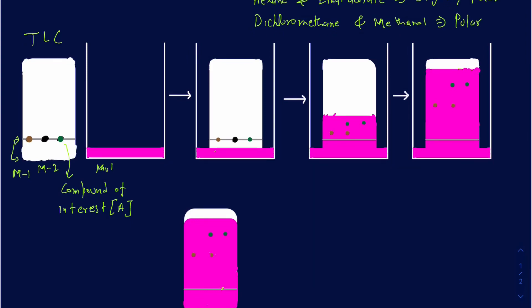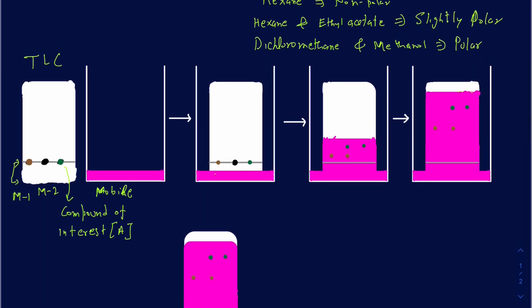You put this TLC plate into a beaker that contains the mobile phase. One thing you must make sure is that the baseline — where your starting point is for the compounds and mixtures — is a little bit above the surface of the solvent. If the mixture is inside the solvent, it may dissolve into it, which would defeat the purpose of the TLC. That's one reason you always make the baseline a little bit above the bottom of the TLC plate.